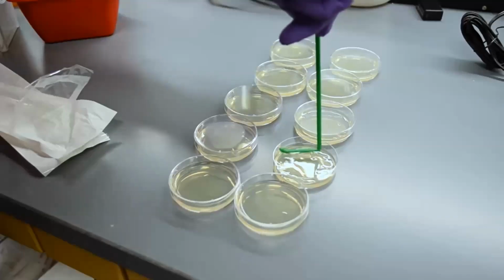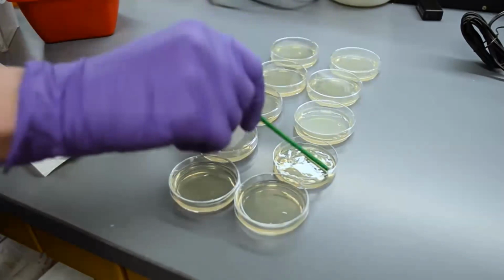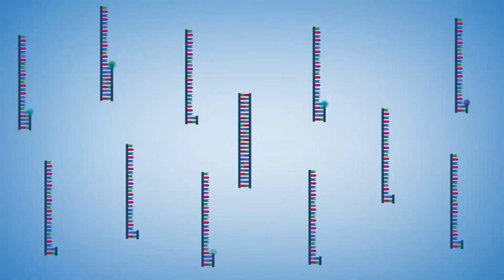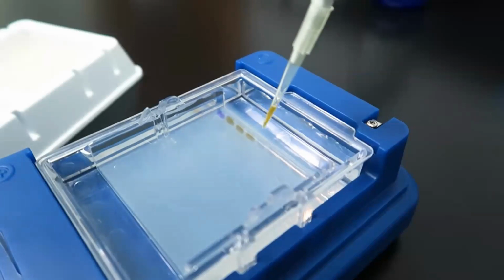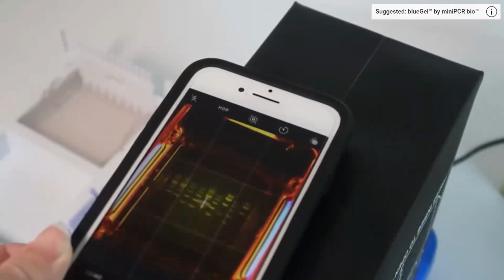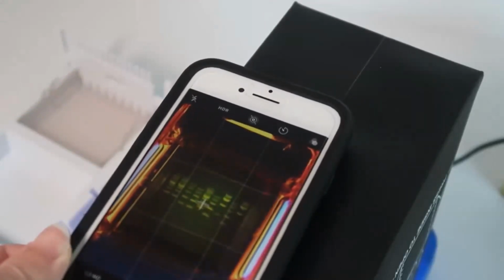What we do with our new DNA copies after our PCR finishes depends on our experiment. We may insert it into a plasmid so that a bacteria will produce a certain protein that we are interested in. We may use it to do DNA sequencing so we can learn the exact sequence of nucleotides in our DNA sample. Often, we will run it on an electrophoresis gel so that we can visualize the size of our DNA fragment or confirm that the PCR worked as we expected.